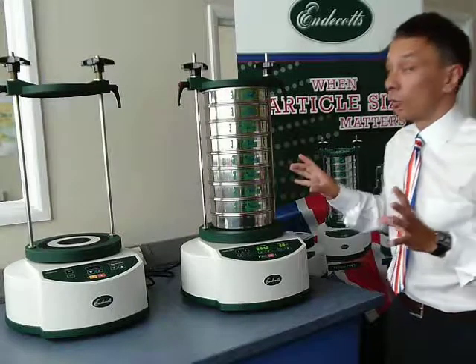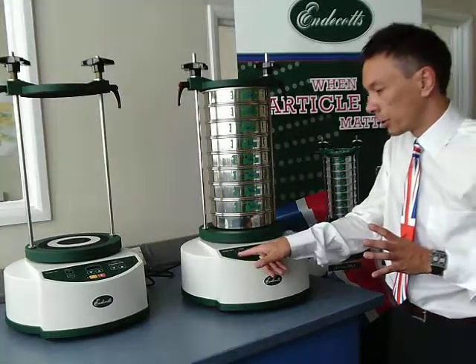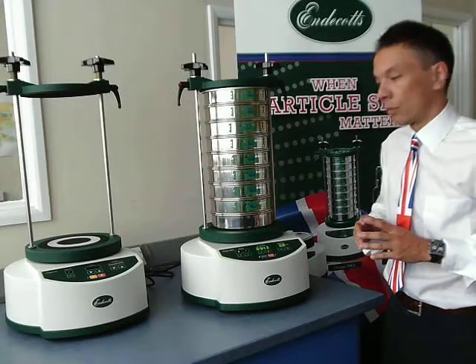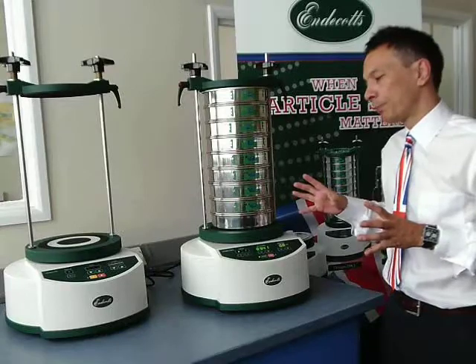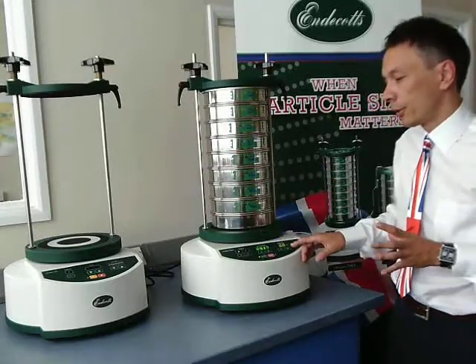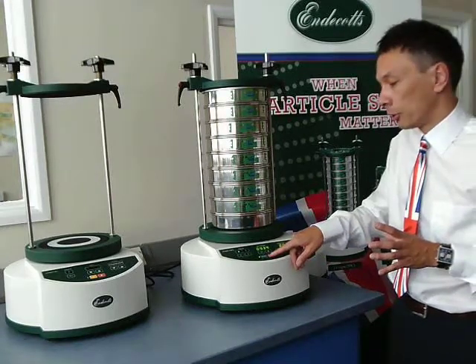The shaker also retains the interval function. For certain materials that are very sticky — coffee beans and so forth — this is a function that is invaluable.